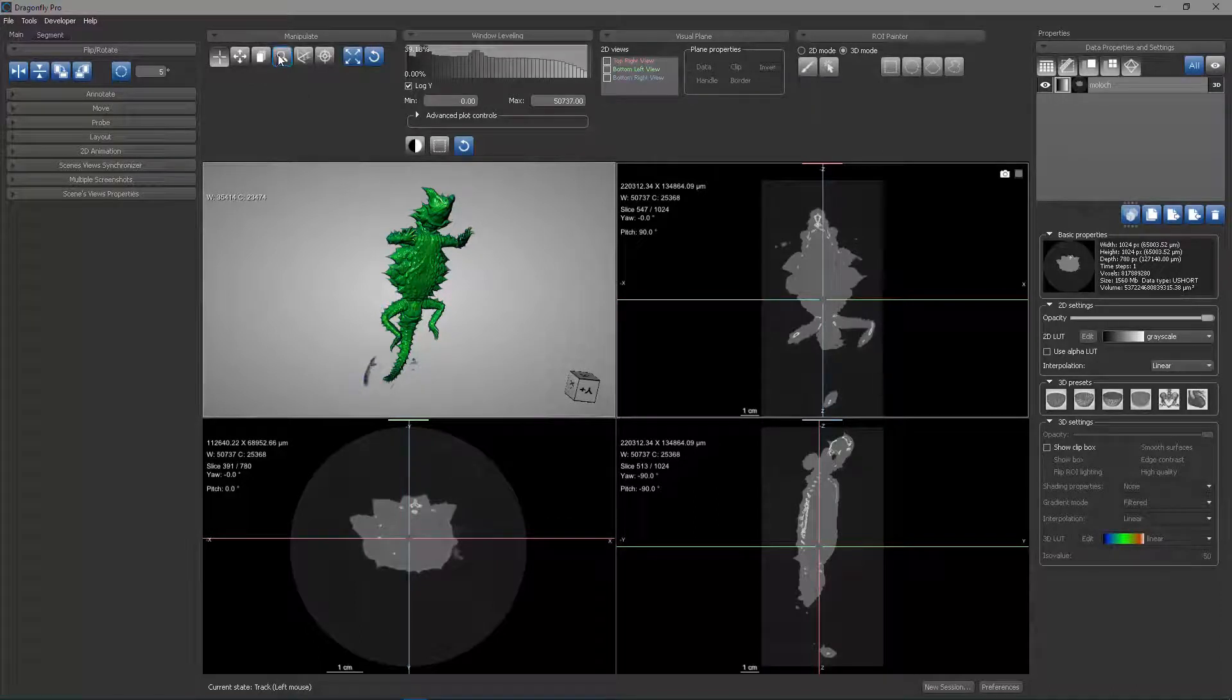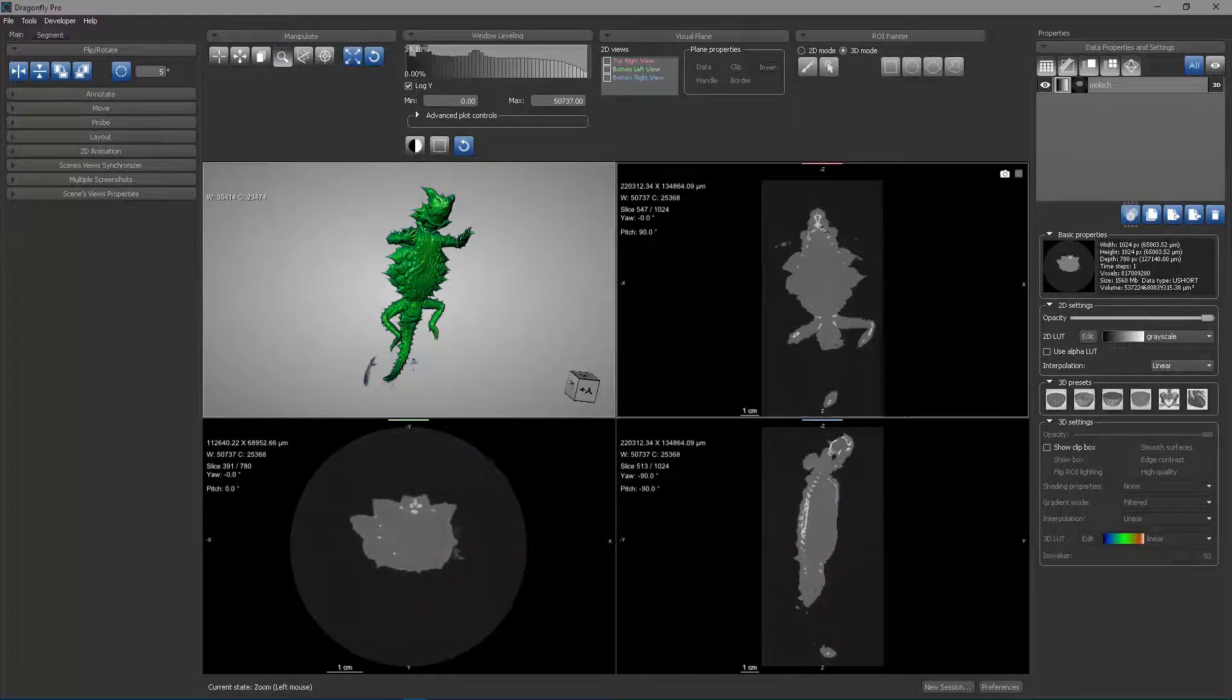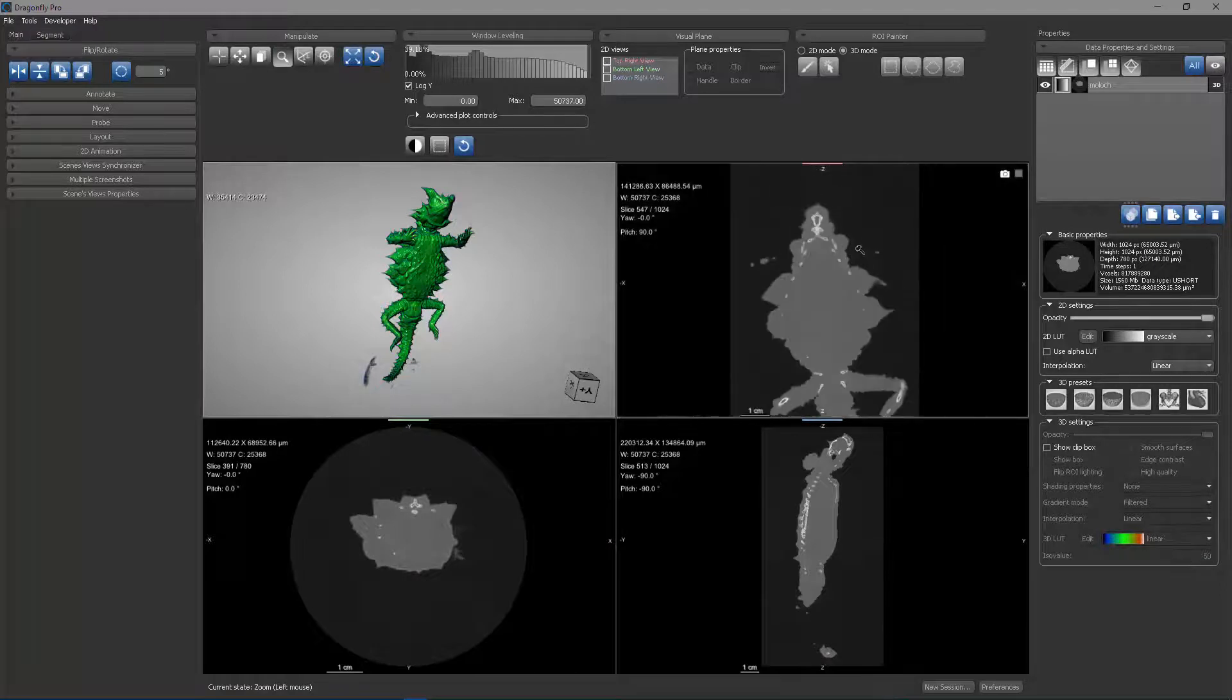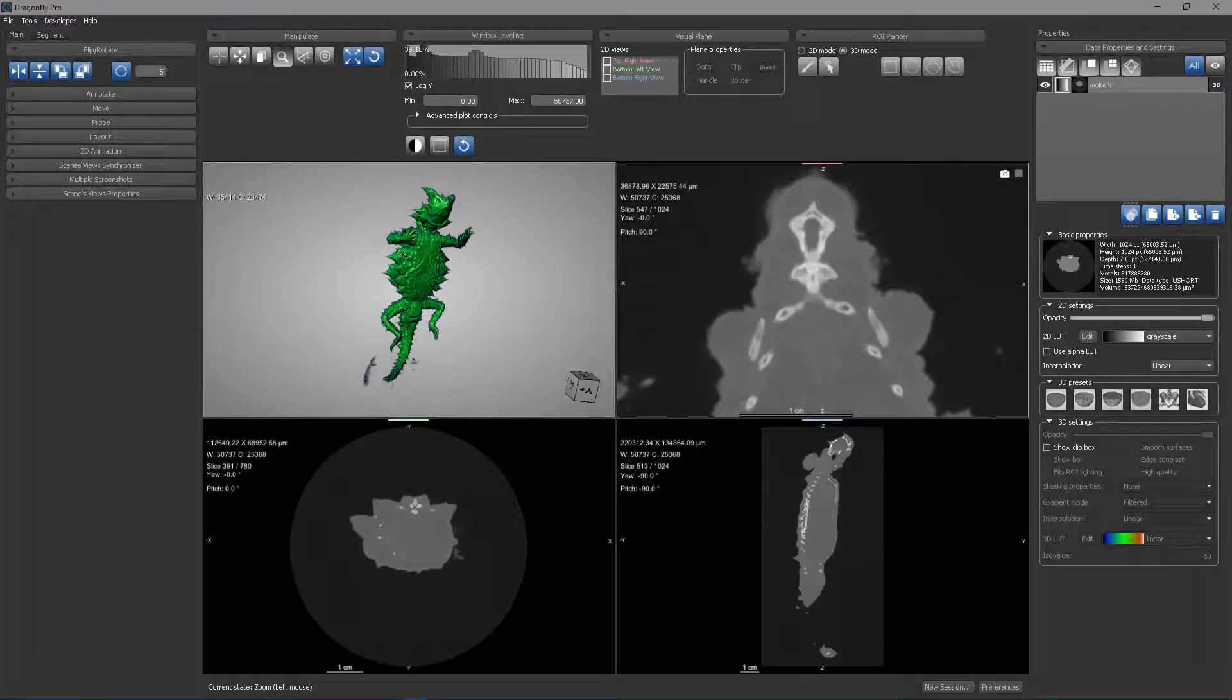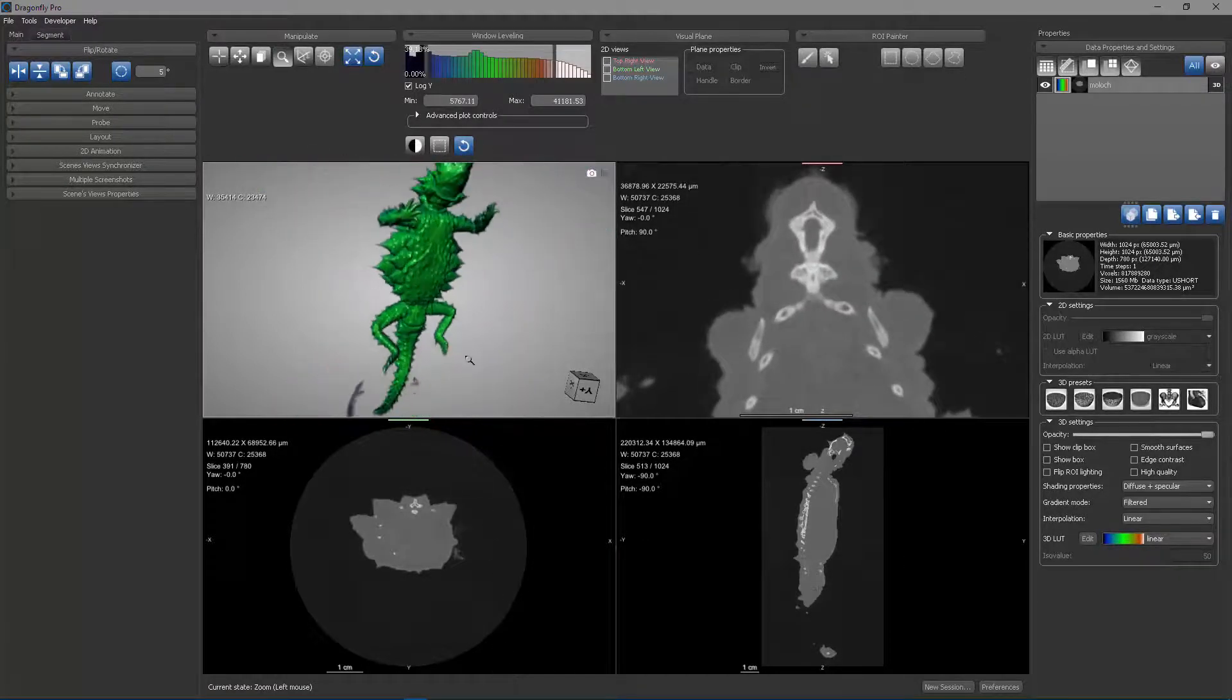The next state is the zoom state, which allows you to drag down to zoom in or up to zoom out. This works in the 3D view and the 2D view.